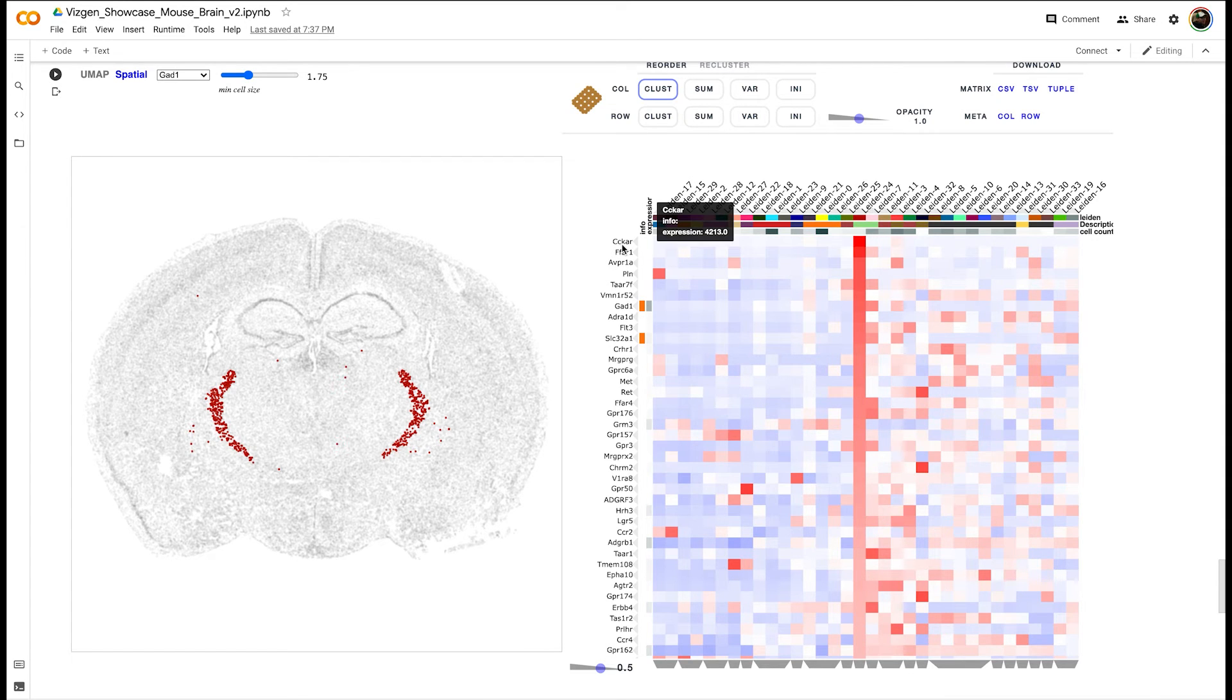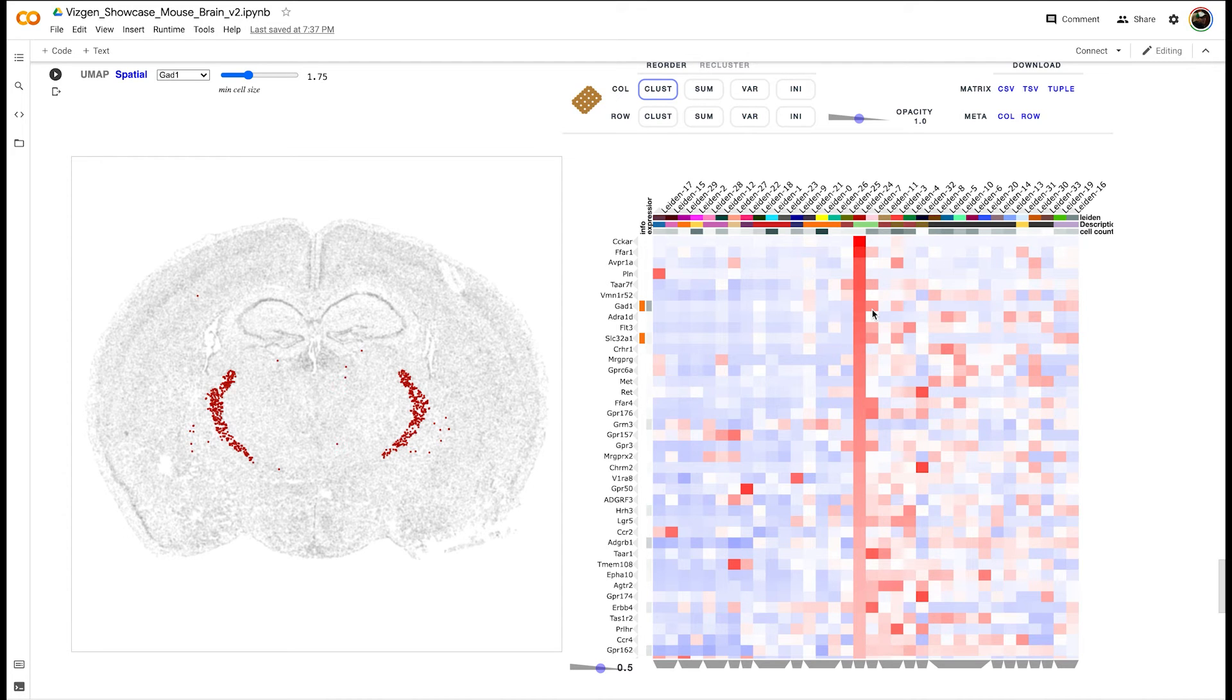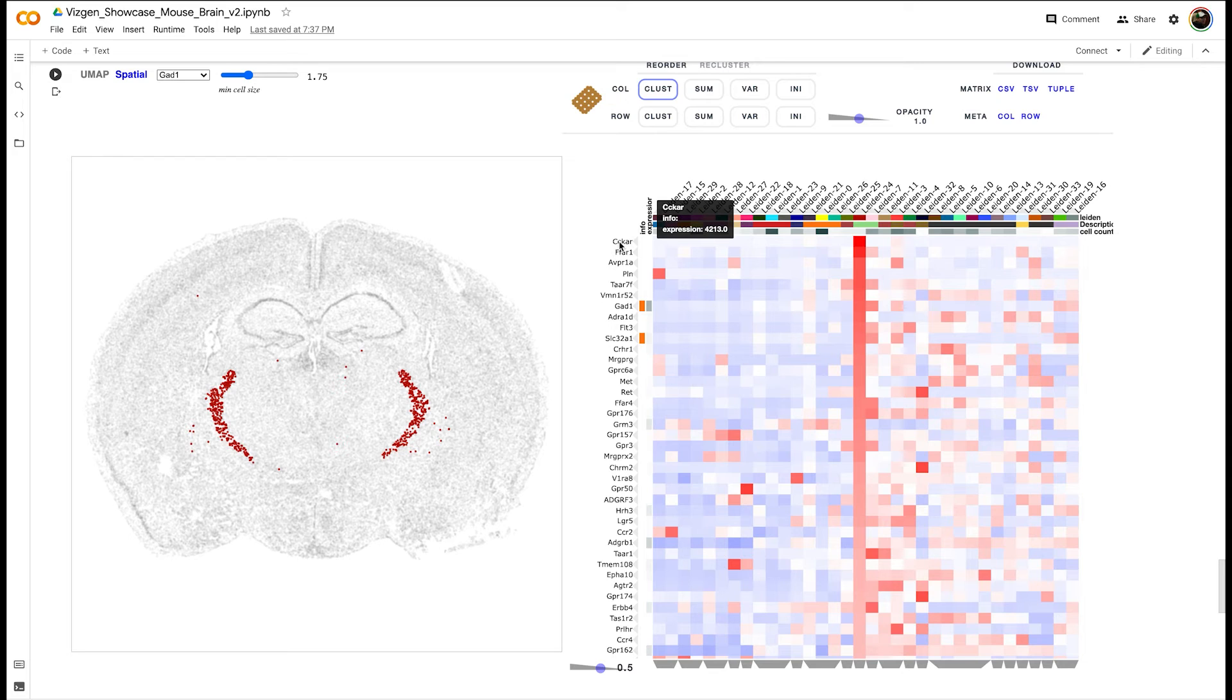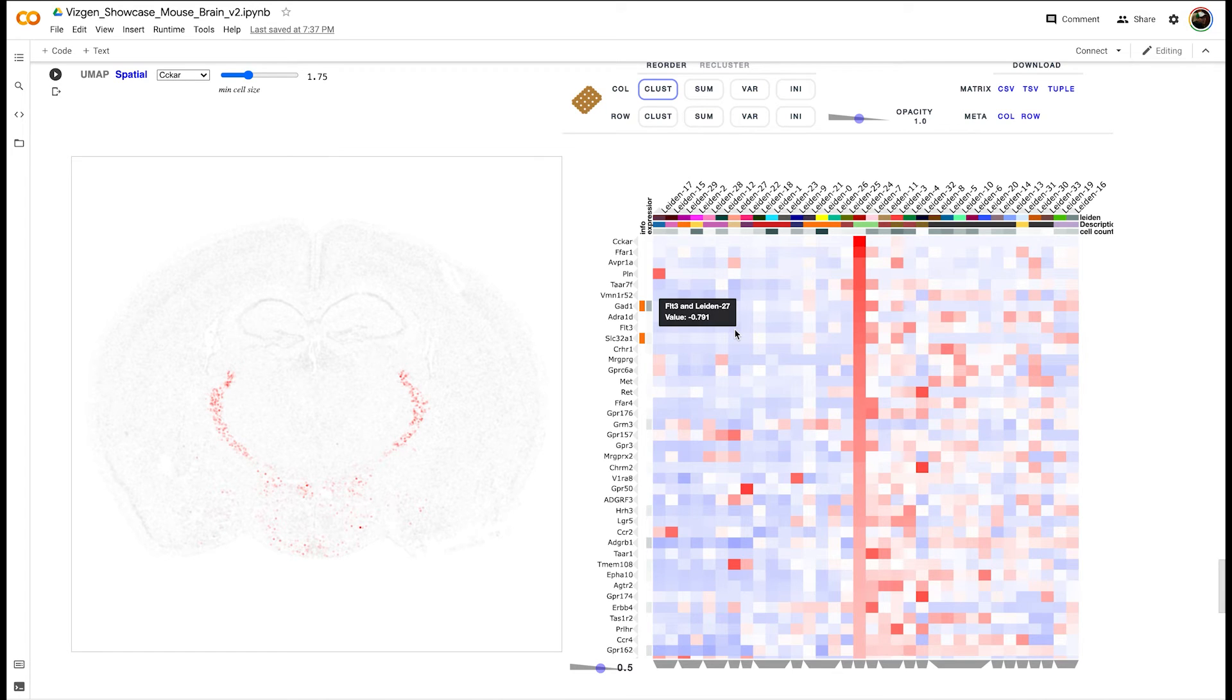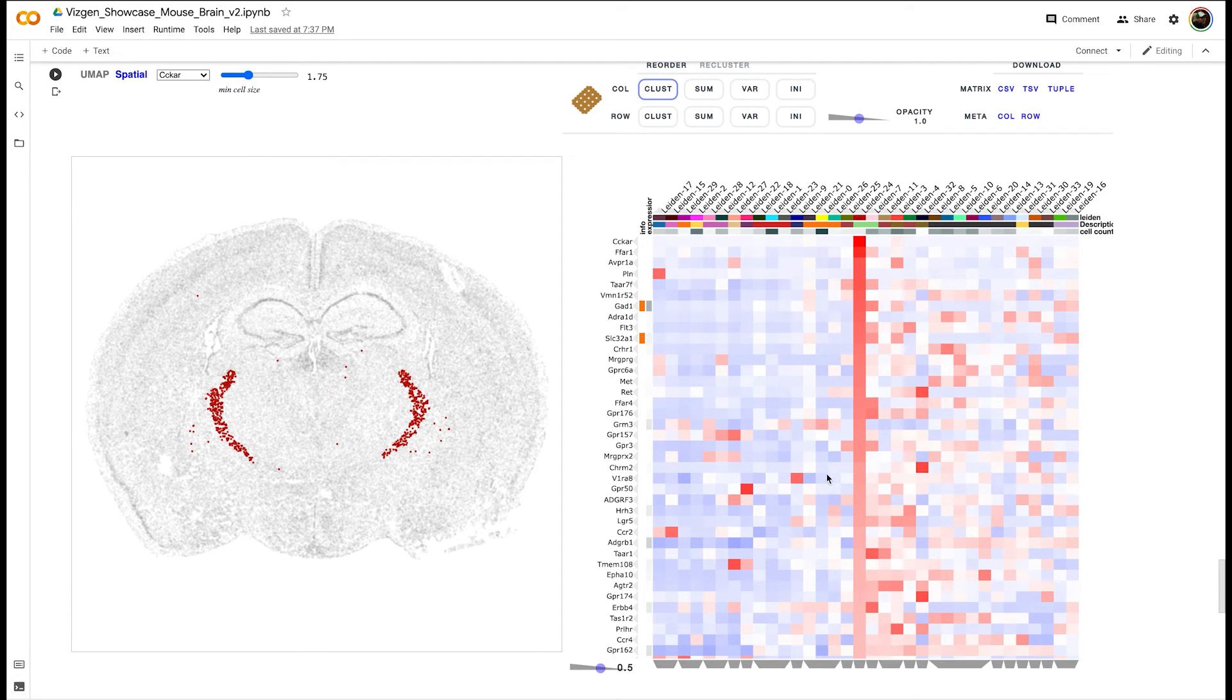Among the inhibitory neuron clusters that we see in our Leiden clusters, this particular cluster is distinguished based on the expression of particular genes like the receptors CCKAR, and also distinguished by its very distinct spatial localization within the brain.